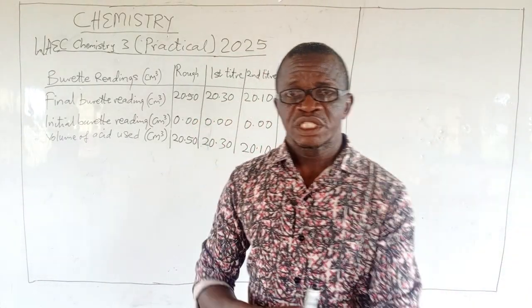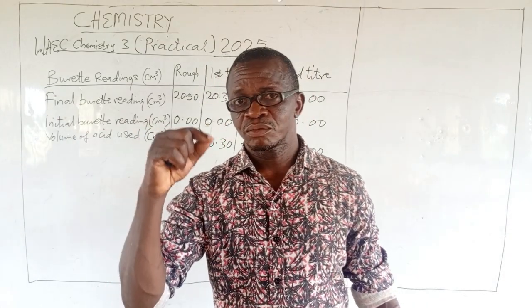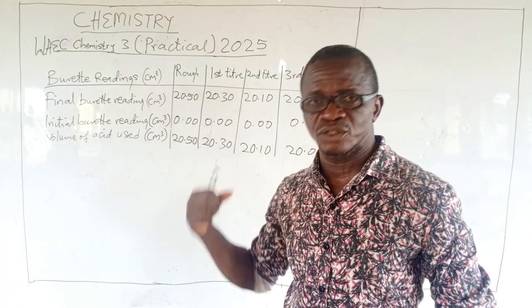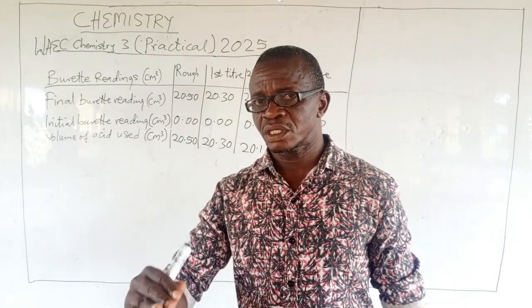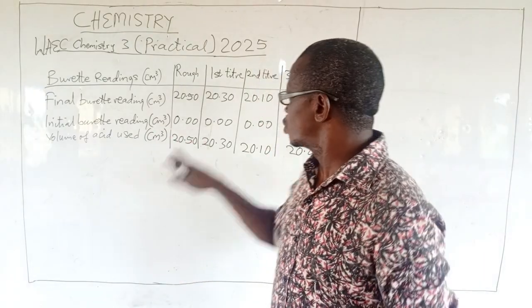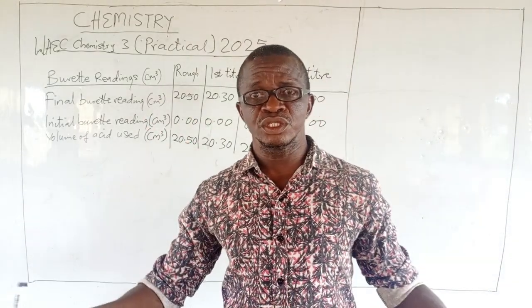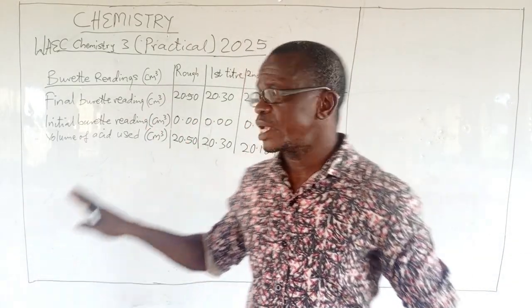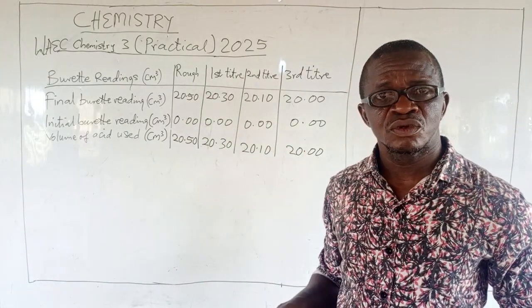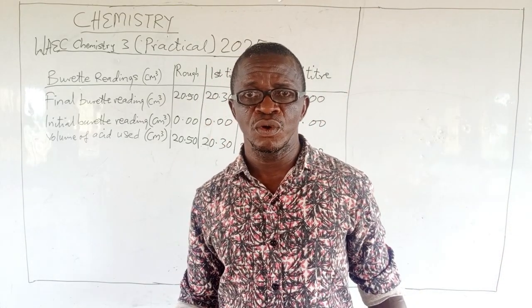If you wish, in one of my earlier videos, I taught how to carry out titration. You can refer back to that. Check the processes, how these values are generated. You are the one to generate these values. Draw the table. They will only give you the space for you to draw the table, and then carry out the analysis, the titration, and fill in the values. Use those values for your calculations. Other questions will follow.